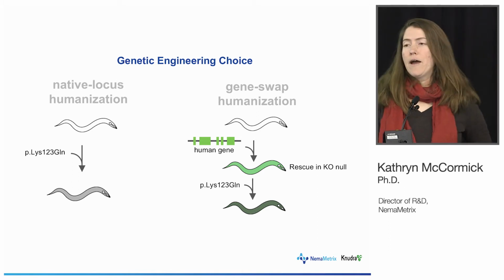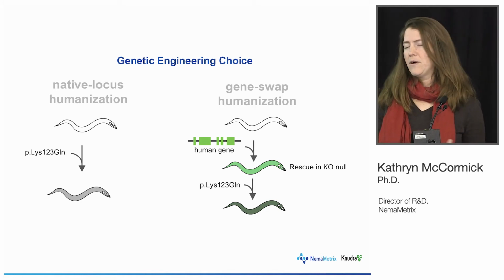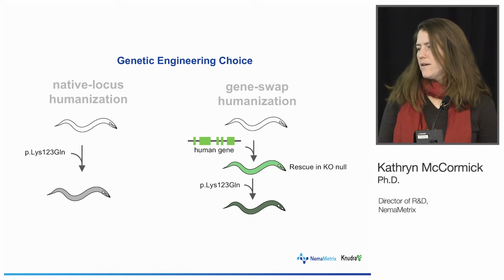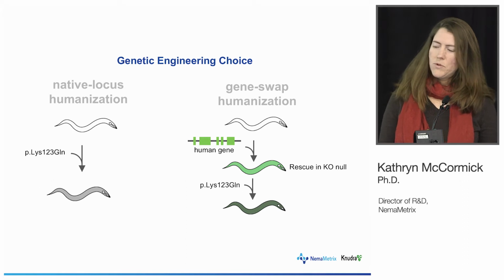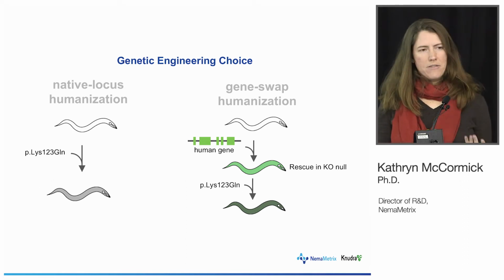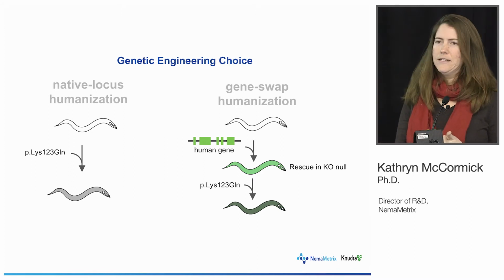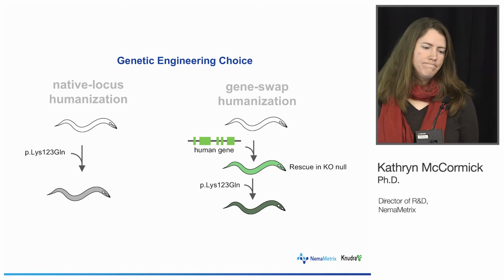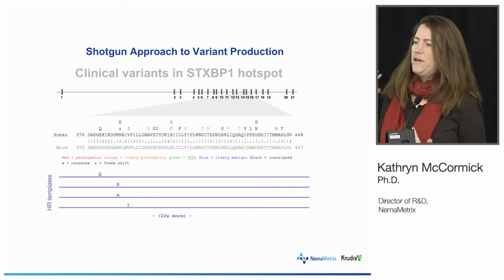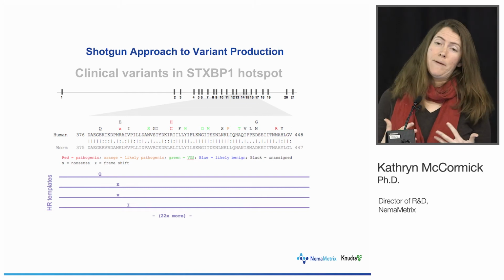Chris has a lot of great data about how these installs of human genes actually function inside C. elegans, and they rescue phenotypically the knockouts of C. elegans genes. And with those genes, we can then add on another layer where we take a patient allele that is pathogenic, and we can install it inside the human gene that's now expressed inside C. elegans and see the pathogenicity.